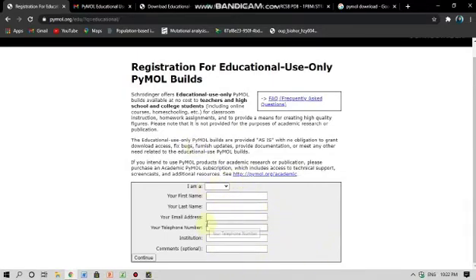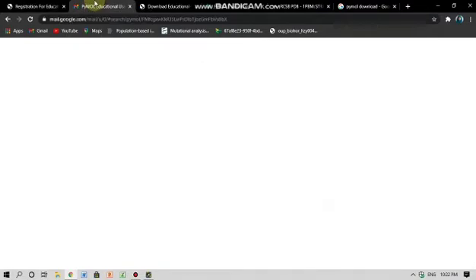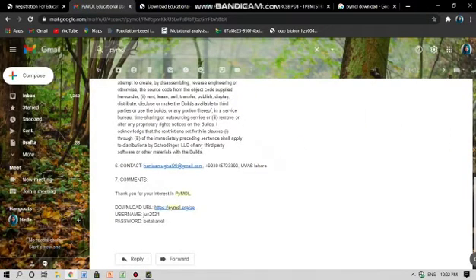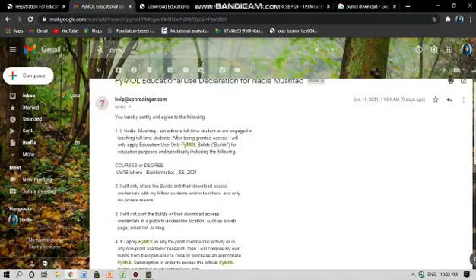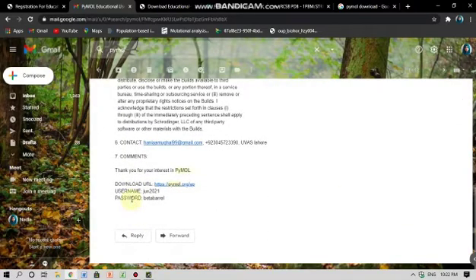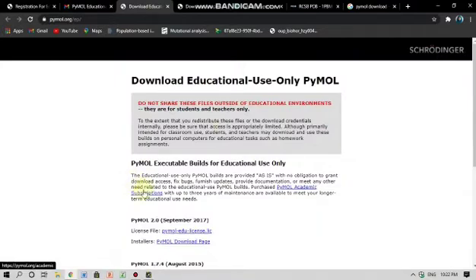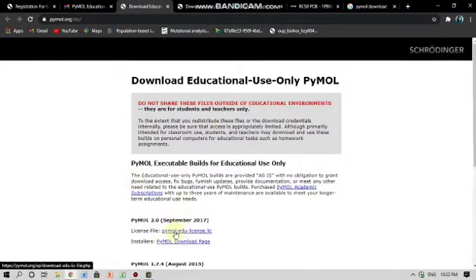They will send an email to my email address. I got this email from them. I will go down and see the username and the password that they have assigned me. I will click on this and this will appear. I will click on the license file and the text file will start to download.